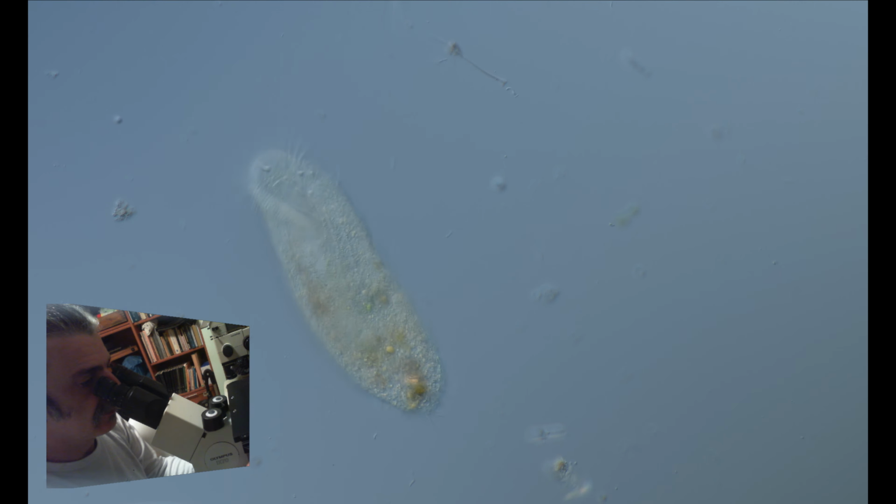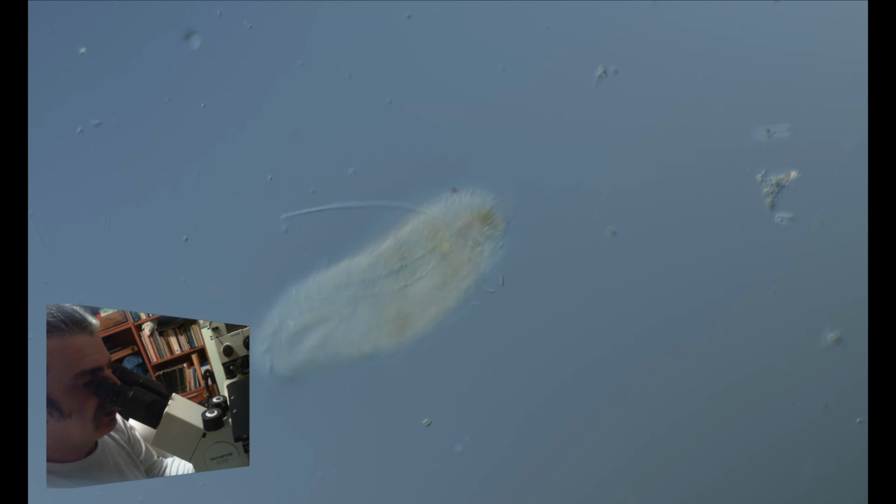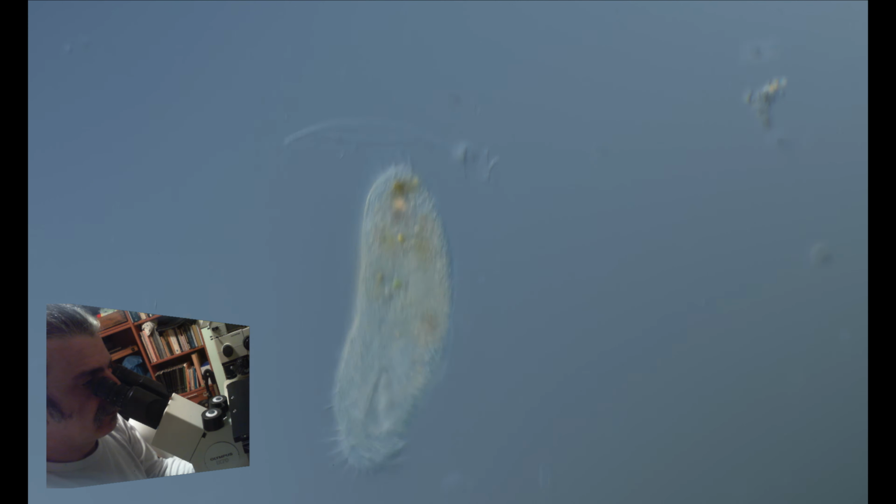I need to adjust the objective better, but this guy doesn't want to stop. Oh, now it's much nicer. And you can see those thick cilia. Okay, back to 10.